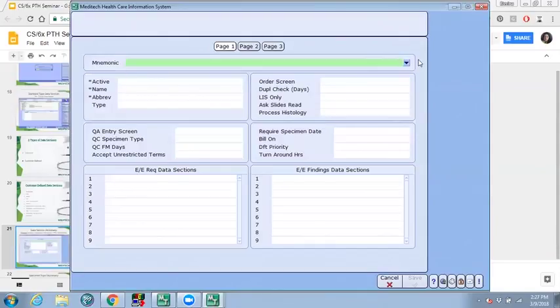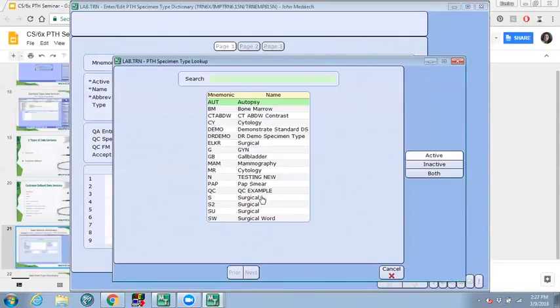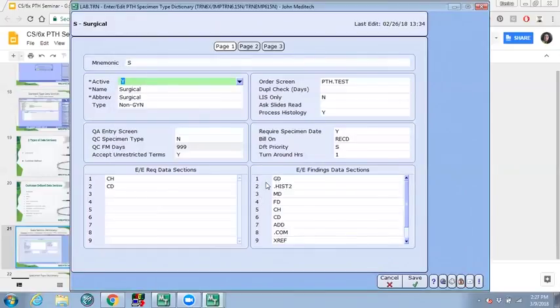So let's take a look at how you can define a specimen type through this dictionary. Again, I'll be using a predefined one. I'll skip the first 4 and go under the type. At the type prompt, there are 3 options: gynecological, non-gynecological, and other. At this prompt, you have to enter the type which corresponds to the entry being defined: for gynecological tissues you choose GYN, for non-gynecological tissues, non-GYN, or for other tissues, other.